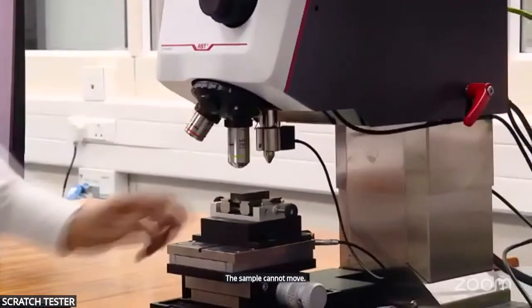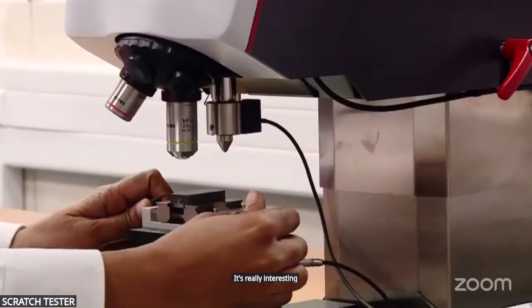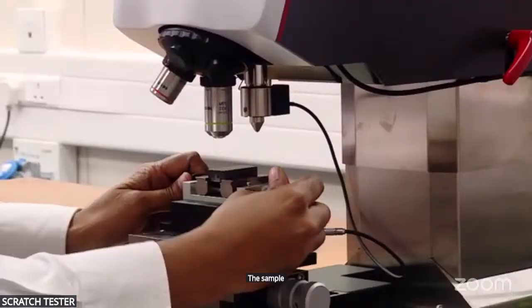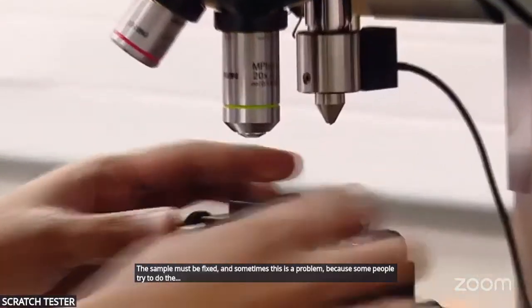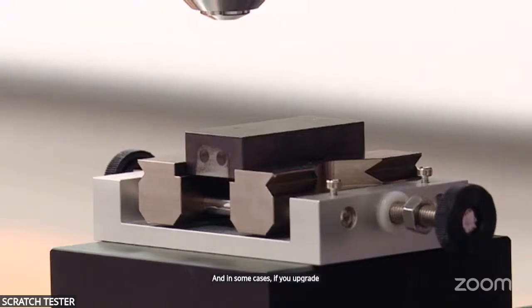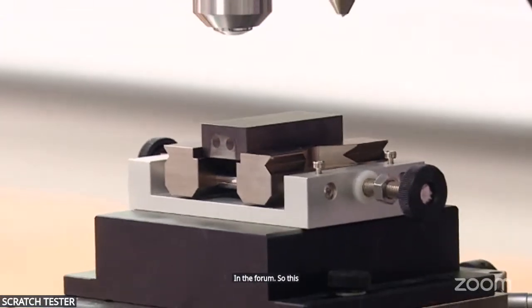If the sample moves during the test, this is not good, because the penetration will change, so you cannot have good data. The sample must be fixed. Sometimes this is a problem because some people prepare the sample in epoxy, and in some cases, if you apply 200 Newton, the epoxy will deform. So this is something you have to avoid.